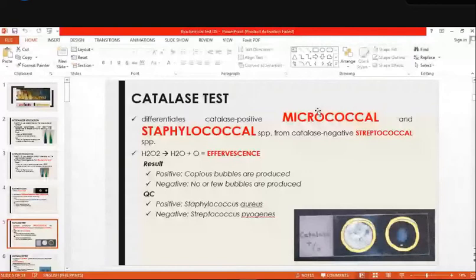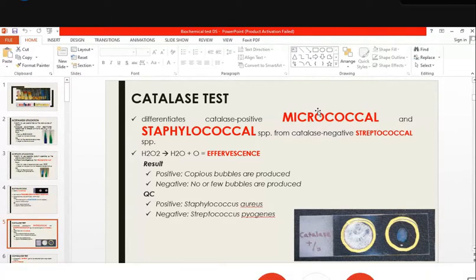Again, you see here the reaction. Pag meron kayong slide, nilagyan natin yan ng ating inoculum. Kumuha tayo sa pinag-isolatean natin ng ating organism. So you just get a portion, you just touch that colony and then ilagay natin siya sa slide. Then our reagent here is 3% hydrogen peroxide. Para ano?